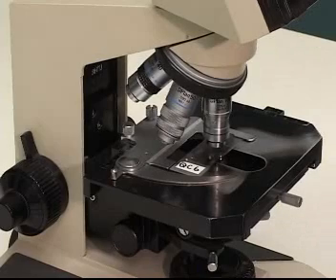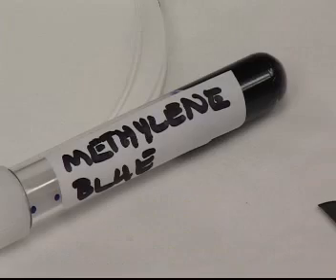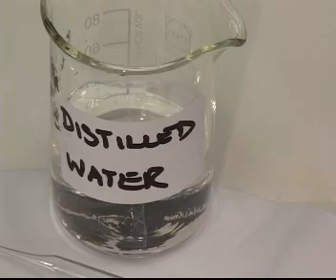You will need the following materials or apparatus to make the slide: a microscope, glass slides, cover slips, a dropper, methylene blue, a toothpick, and a beaker with water. First, place a few drops of water onto a clean glass slide using a dropper.